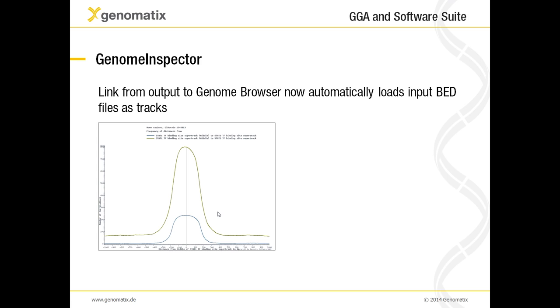These correlation graphs are generated in a way that you have one anchor set with, let's say, the peaks of one transcription factor and one or also several partner sets with the peak positions from other transcription factors, for example, or any other set of genomic regions.